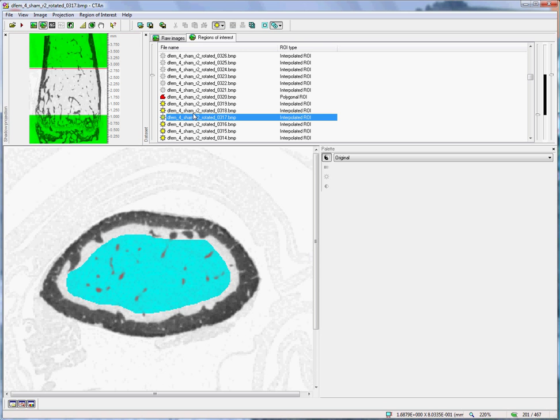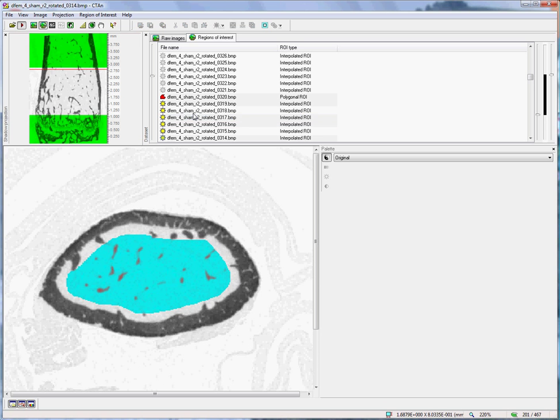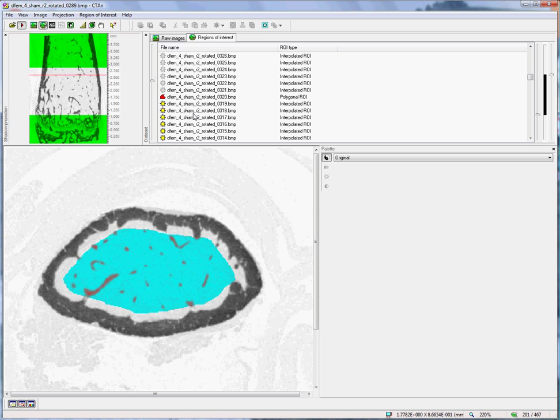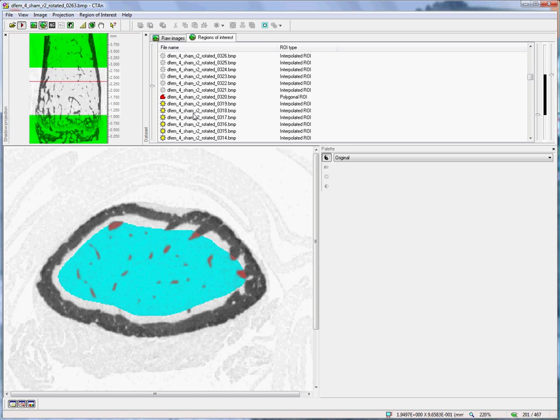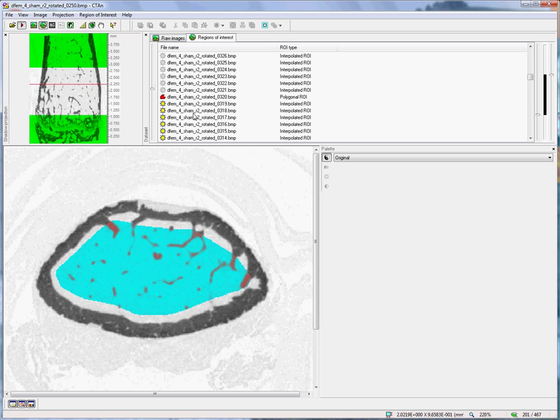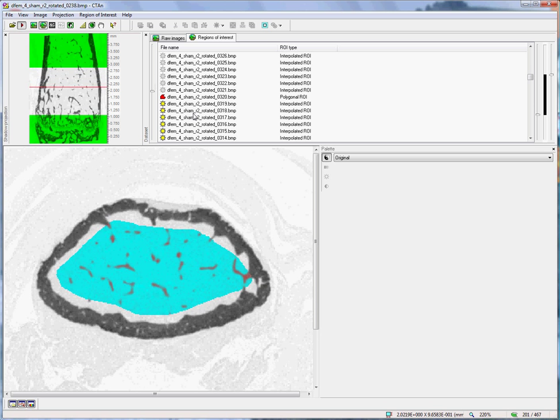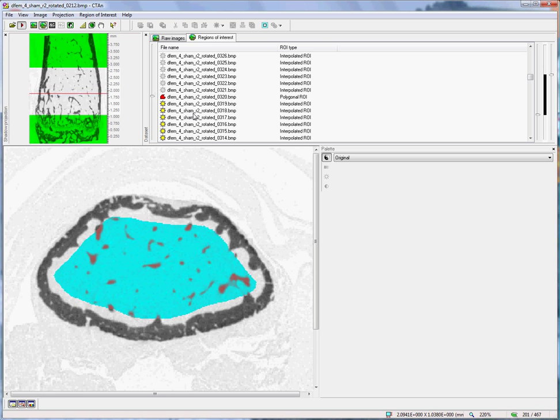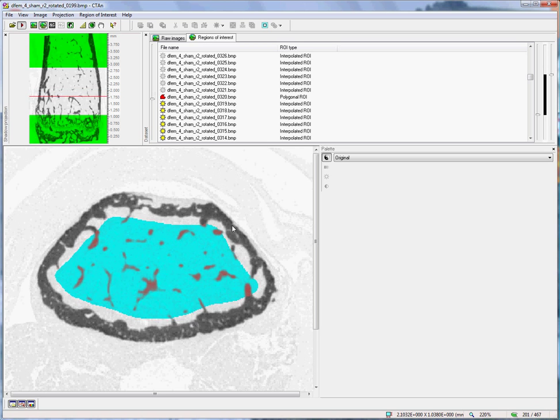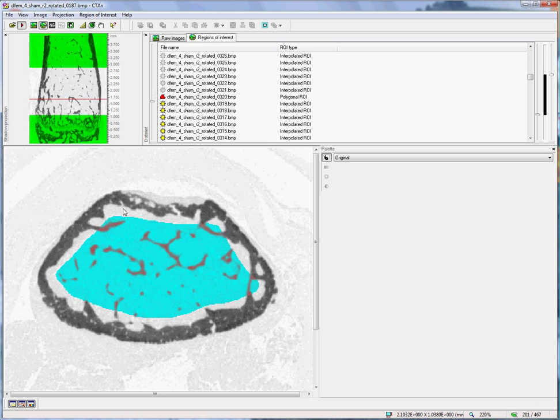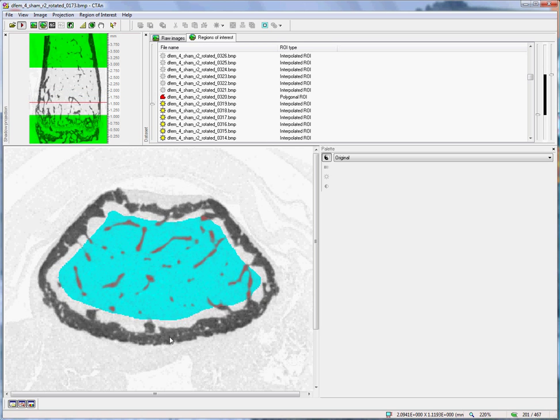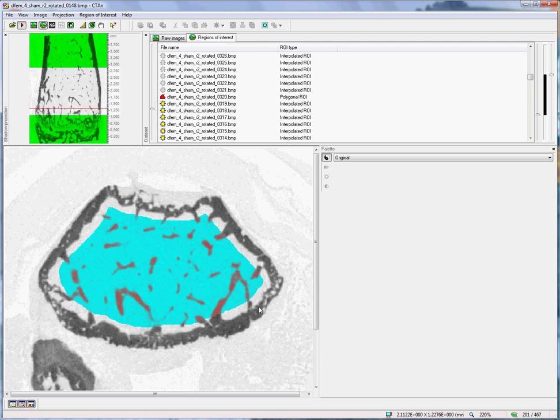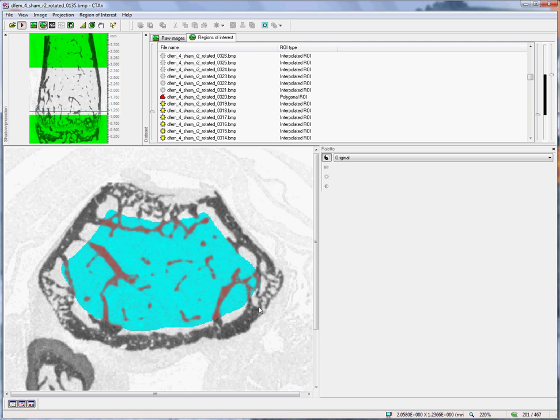With the region of interest complete, I can hit the spacebar to animate through the slices and check, most importantly, that my ROI has not included any of the cortical bone. Excluding a little bit of trabecular bone around the outside is not so much of a problem.